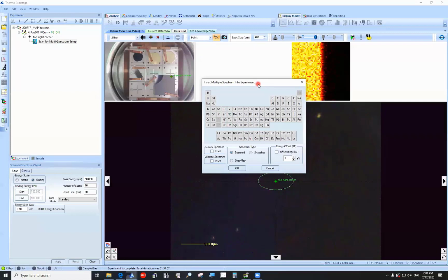I'm just guessing here, but I would imagine on this particular sample, you're probably keenly interested in a response from lead, from iodine, and then likely a series of other different kinds of contaminants, something like carbon, oxygen, possibly nitrogen, chlorine, maybe something else that you guys have built in there. I don't know what halogens you're playing with here, but we need to select every element of interest before we move further. So other than carbon, nitrogen, oxygen, lead, and iodine, is there anything else that we should be searching for as far as the composition of your specimen?